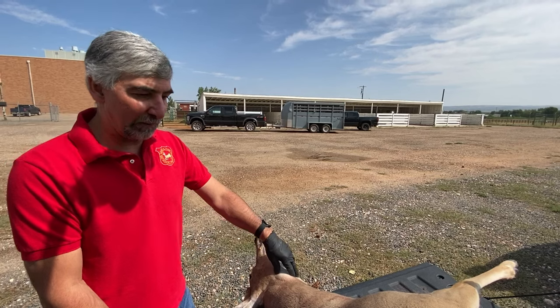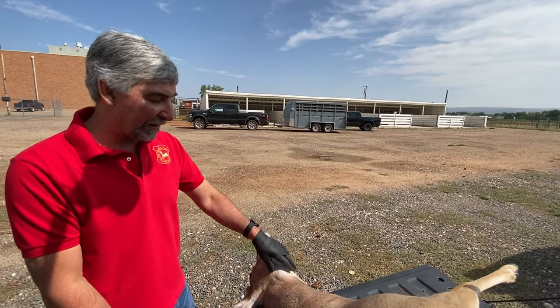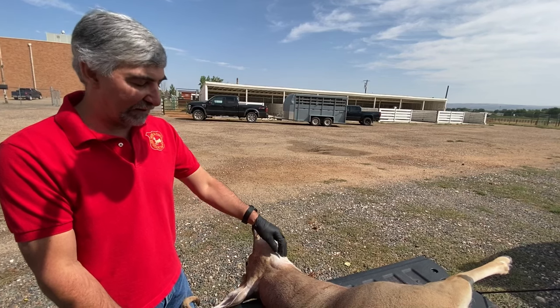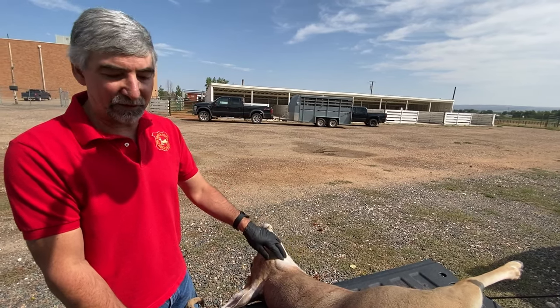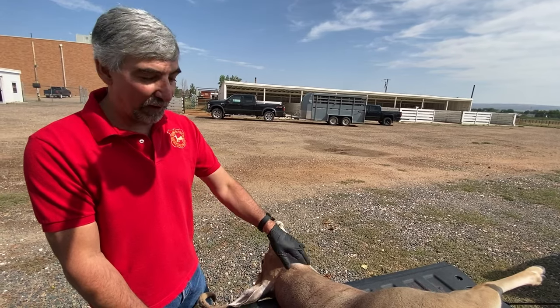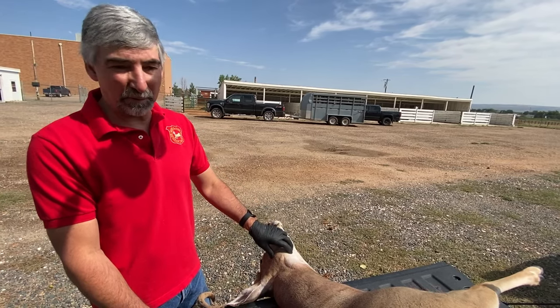So if you have an animal that you'd like to get taxidermied, we recommend that you take that to your taxidermist — just have them cape it out and then have them give the head back to you. And you can bring it to a Game and Fish office or follow the directions here on how to remove those lymph nodes.